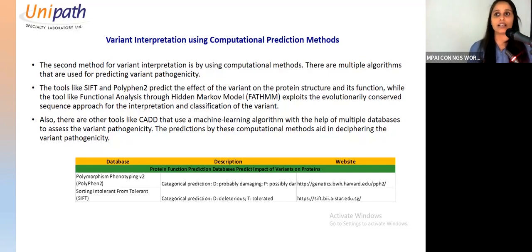There is also a disadvantage that you might miss the one which is actually true but called by only one caller. So it's again one call. Basically, this whole analysis is nothing like black and white. It's all gray. Everything depends on your decision, and experience matters.